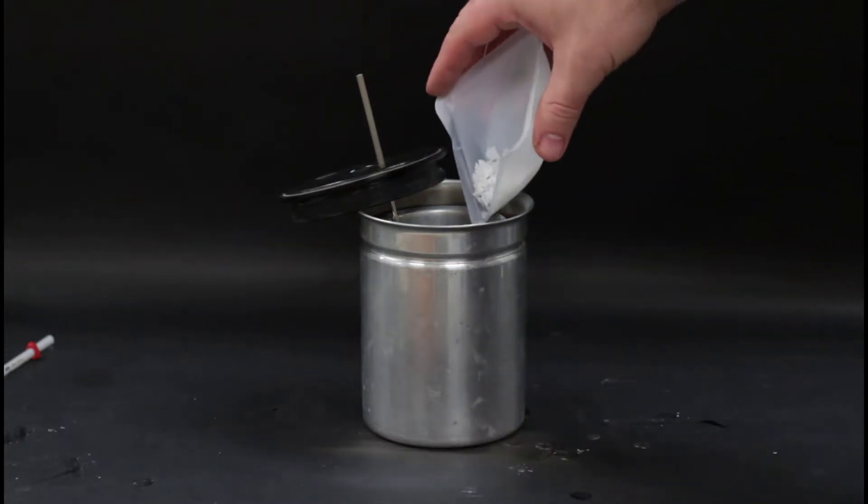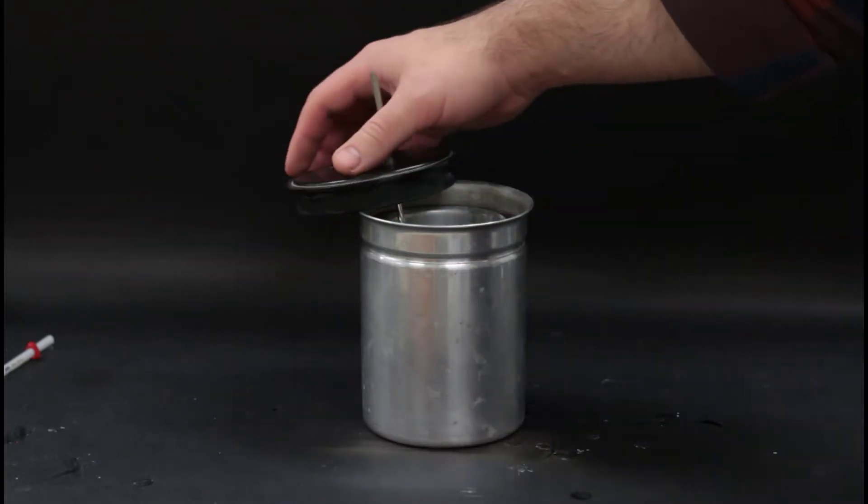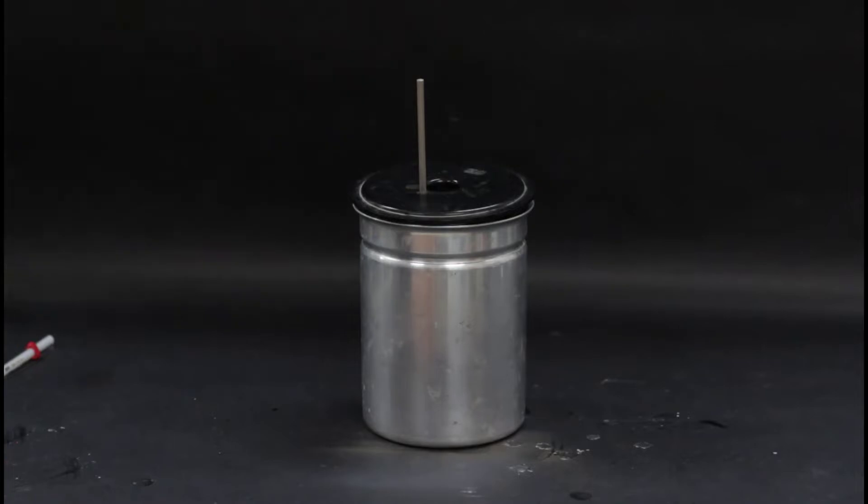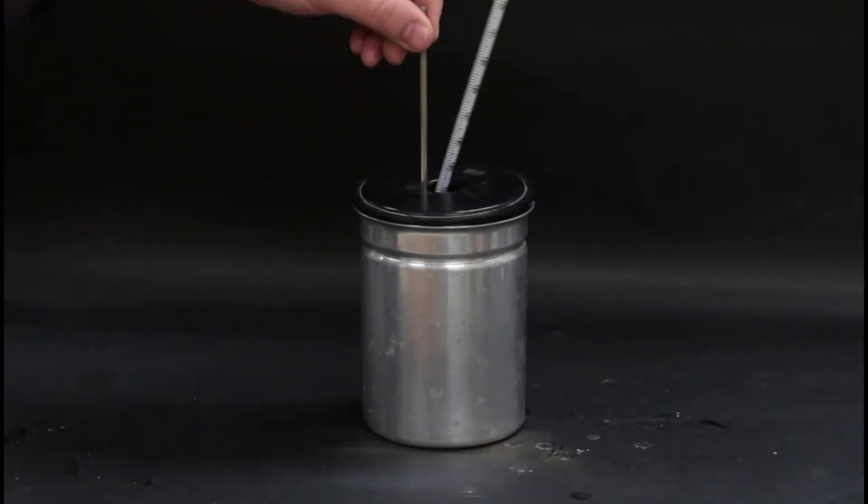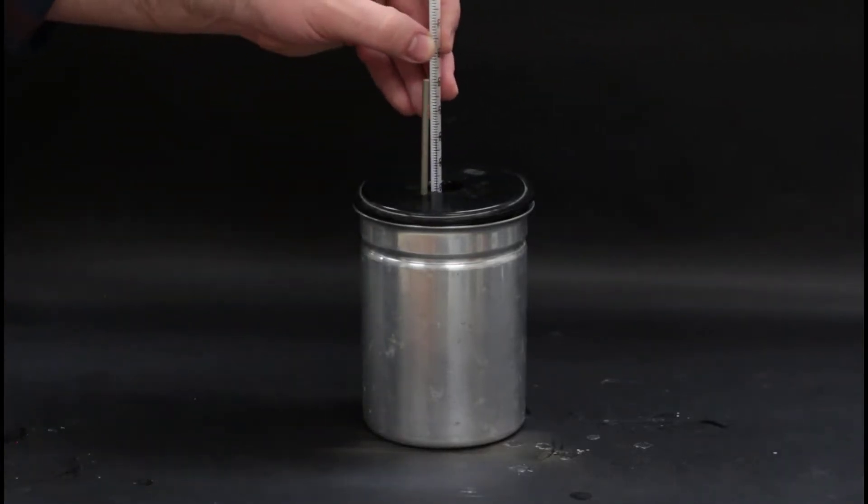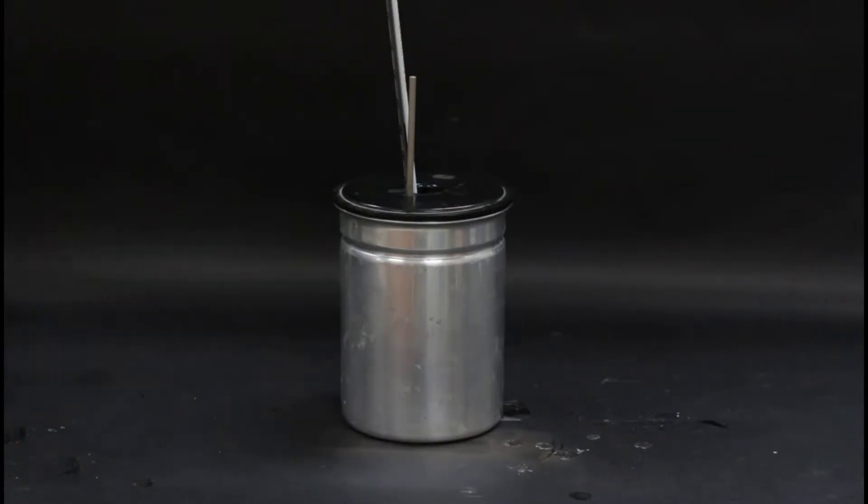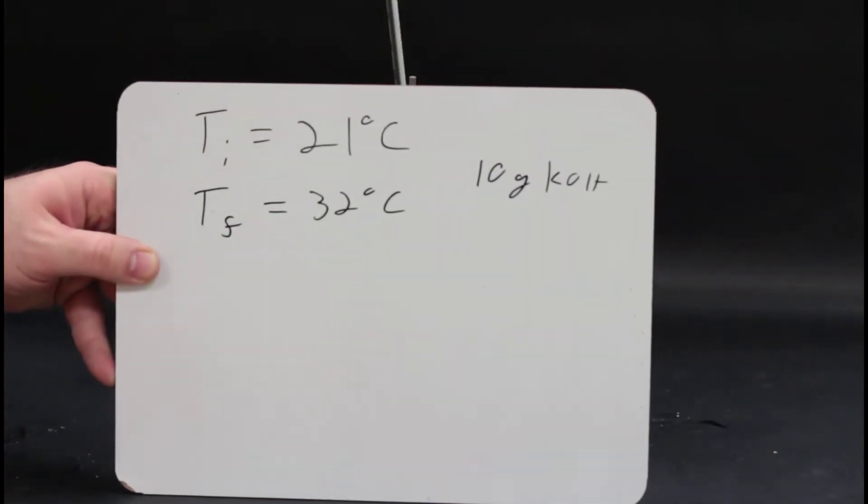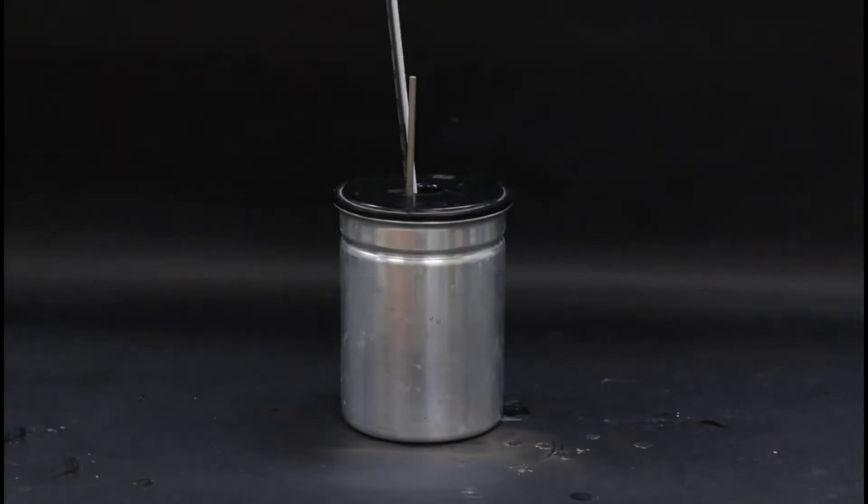Weigh 10 grams of your salt and pour it into the calorimeter. Use the stirrer to fully dissolve the salt and keep an eye on the temperature. Record the maximum temperature that the solution reaches. We'll use that change in temperature in our calculations. Then, dispose of the solution.